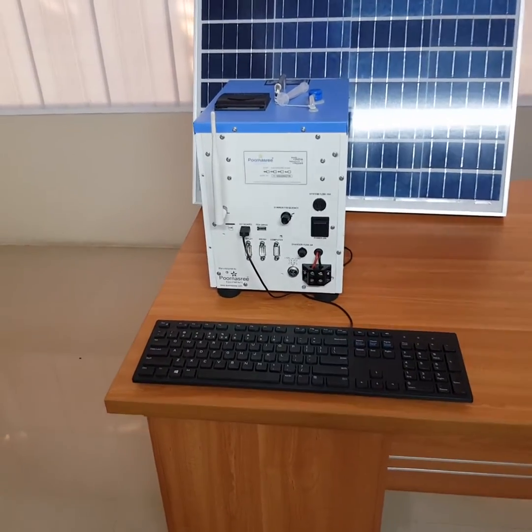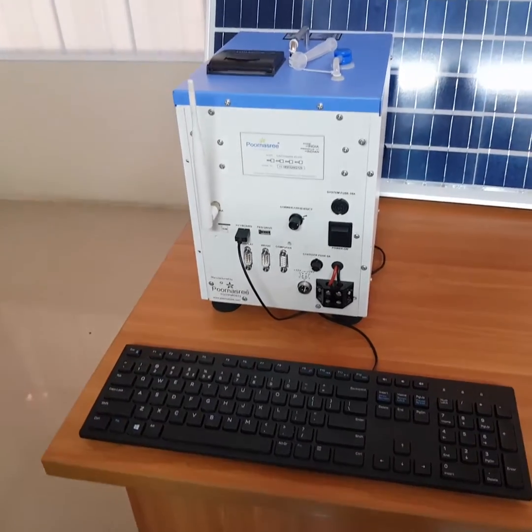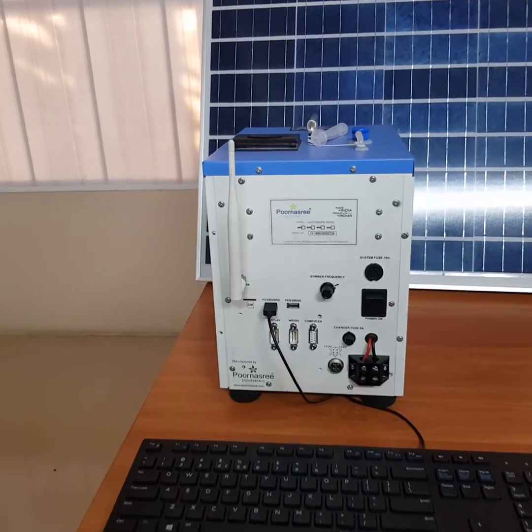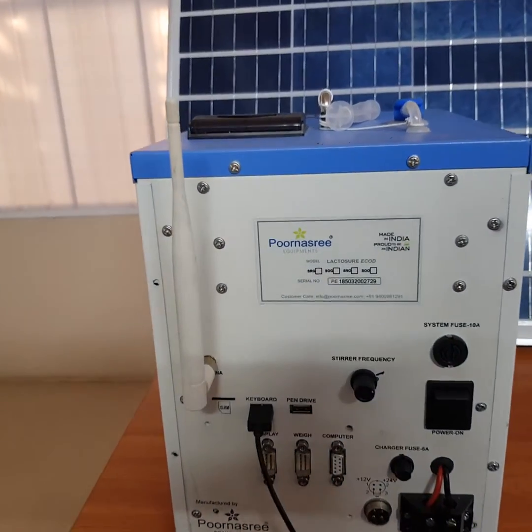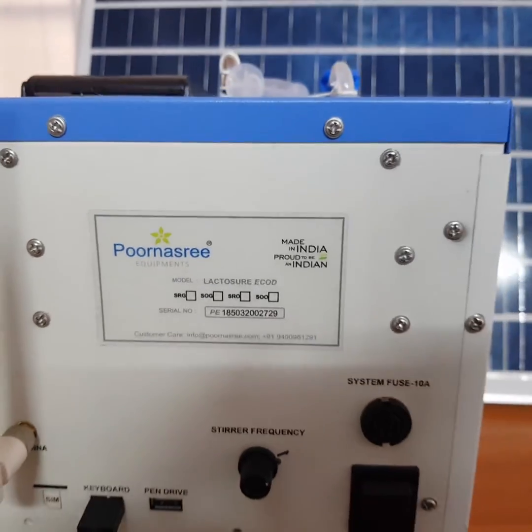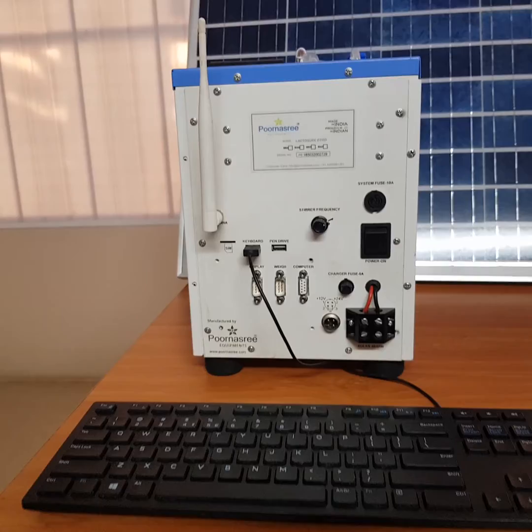Milk analyzers from Purnasri Equipments are fully made in India. Analyzer parts including sensors, main boards, and pump assembly are built in-house at our facility in Kerala. Hence, we can ensure the availability of spare items quickly and whenever it is required.